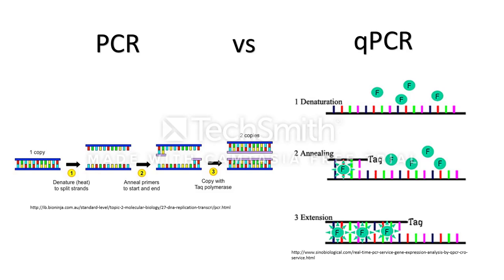How exactly is qPCR different from the process just described? qPCR is different from regular PCR in that it utilizes fluorescent dyes to quantify the amount of product that is obtained after each cycle by the real-time PCR machine. How is fluorescence in qPCR quantified, though? There are 2 different ways in which fluorescence is incorporated into the amplicon and then quantified.